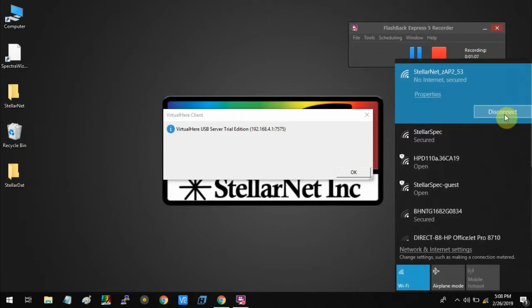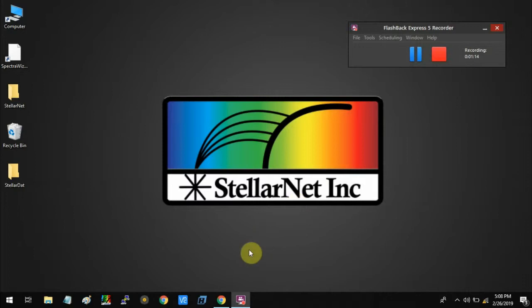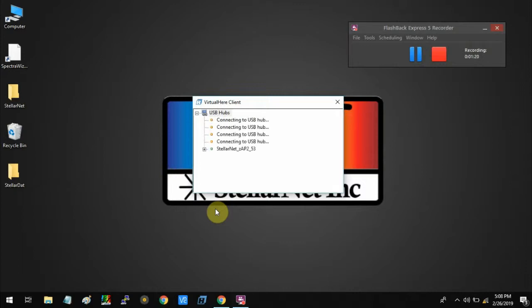Now you can see our zAP2 spectrometer successfully connected to the access point. Now I'm going to open VirtualHere. As you can see, our VirtualHere client software automatically detects the access point over here.